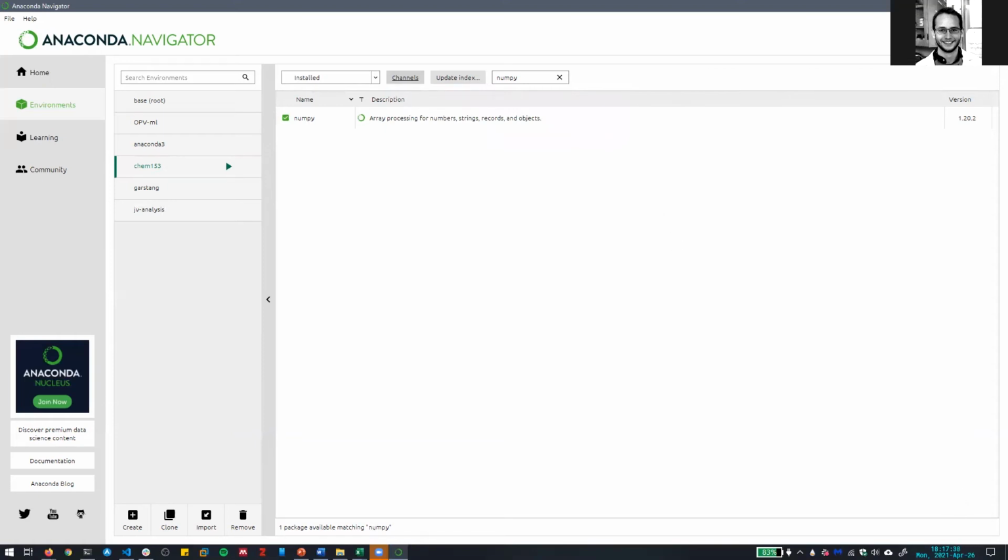So yeah, the list of packages we need, Richard typed a little bit. We need pandas, SciPy, NumPy, Matplotlib, and then I would also recommend JupyterLab. I think that should be everything that we need.